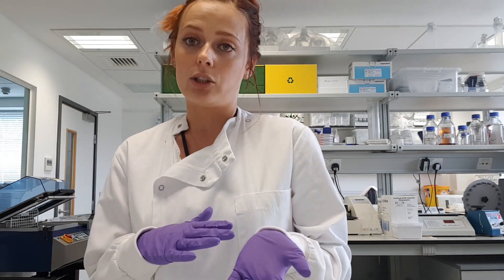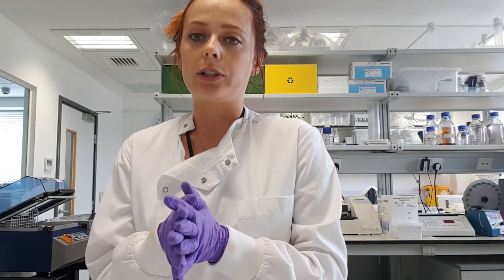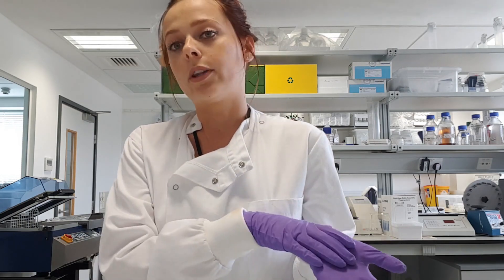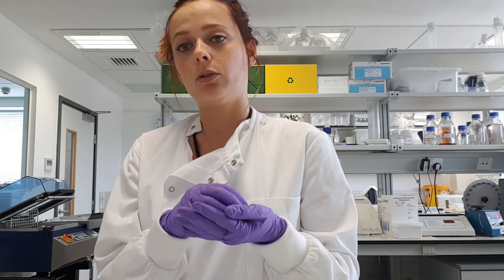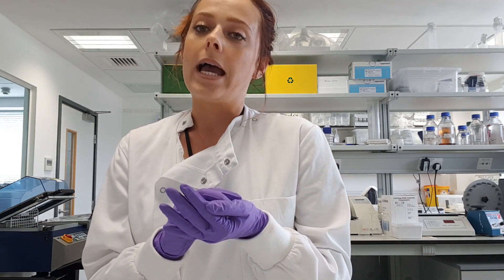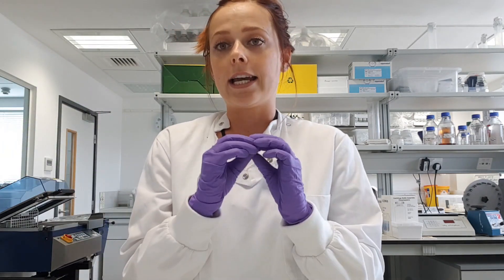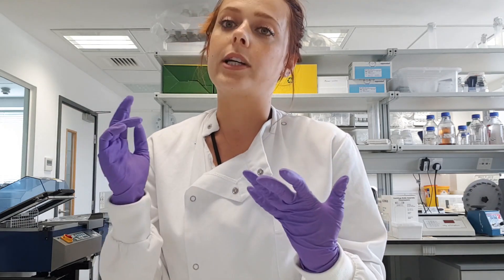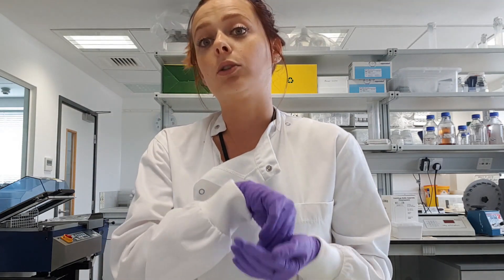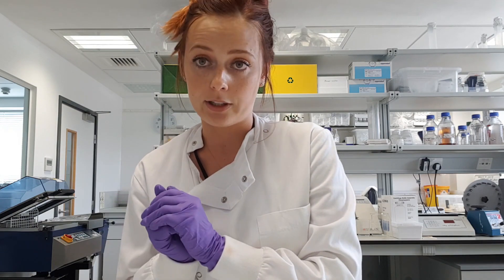I'm going to show you the purification of exosomes step, not the precipitation, as that step is a bit longer. Basically, for precipitation you just add your buffer with your sample, mix it, put it in the fridge at four degrees for one hour to 12 hours, and then you will see a pellet — that will be your exosomes. You remove the supernatant, resuspend your pellet in 100 microlitres of PBS, and then use size exclusion chromatography to purify the sample from proteins and other components.